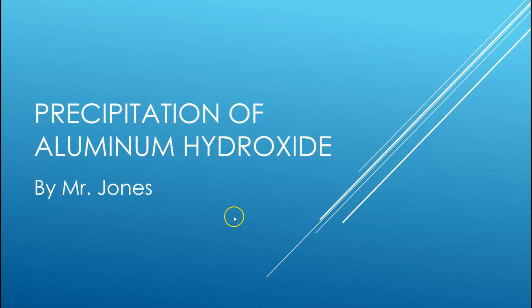Well, enough people had asked me about exactly what I was looking for in a precipitation reaction video that I decided to make a demo of my own. And so this screencast is going to be on the precipitation of aluminum hydroxide. And aluminum hydroxide is actually something that I didn't assign to anybody. And by the time this video is over, you will understand why.